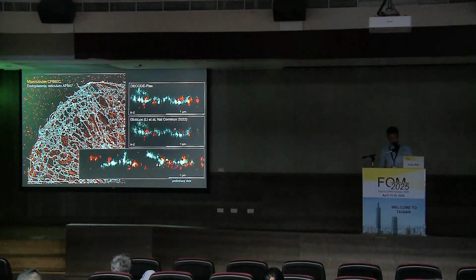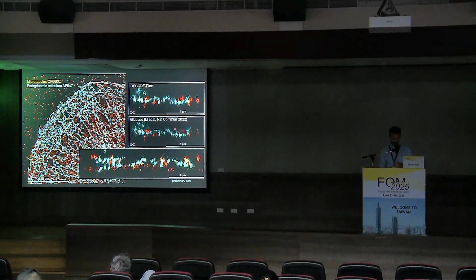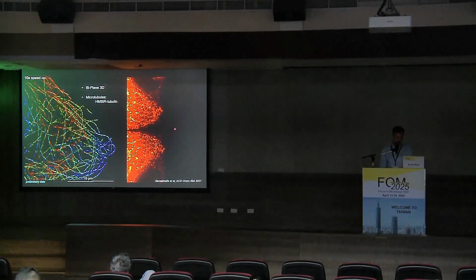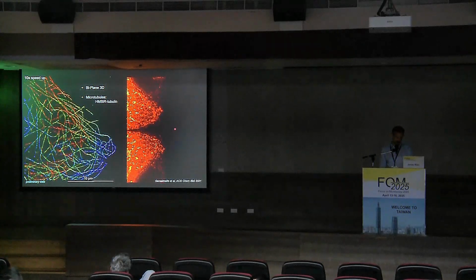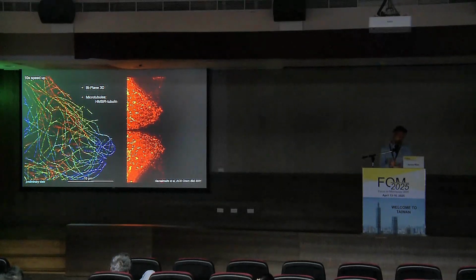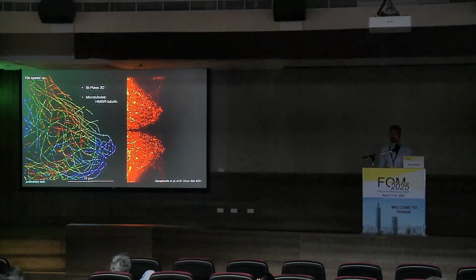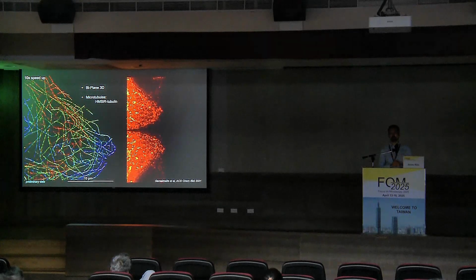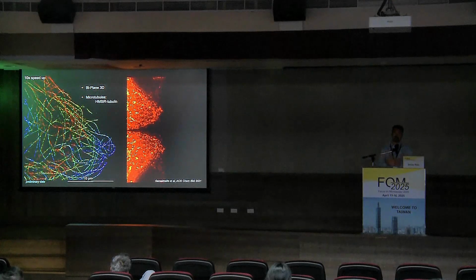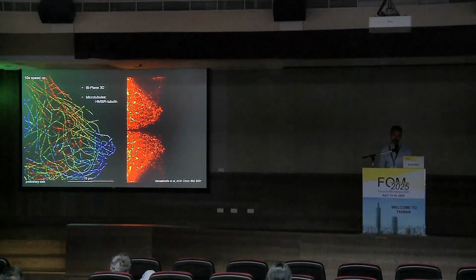And we can now move through side views and appreciate the 3D dual color resolution that we obtain here. Also, we performed dynamic imaging of microtubules, now with biplane 3D super resolution microscopy, again under quite high densities, and you see these dynamic changes of the microtubule skeleton occurring over the time of about 1 minute. I must admit this is more or less the maximum time we can look at it, because if you image for 2 or 3 minutes, we do see that light still induces phototoxicity and leads to changes of the dynamics and the organization of the microtubules.